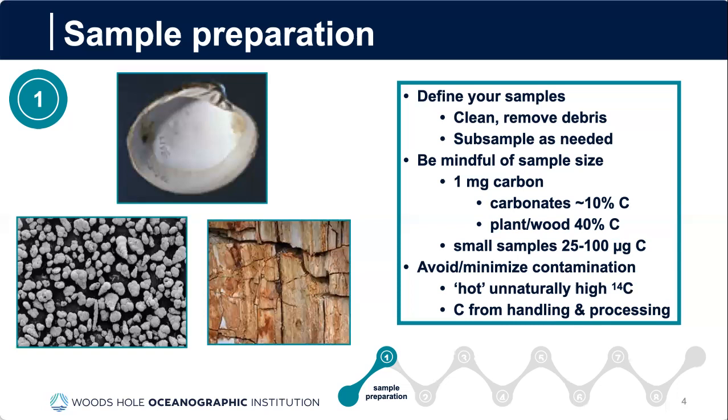It's important to wear gloves so as to avoid transferring carbon or oils from your skin to the sample, and samples should be dry to prevent microbial growth. And most critically, here, you must avoid contamination from elevated, unnatural tracer levels of C14. Hot samples can compromise your own science, but also significantly impact our labs, as we have to thoroughly clean and replace anything that the sample came in contact with.